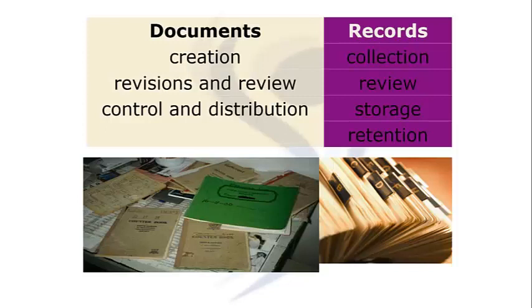Documents and records. Many of the 12 quality system essentials overlap each other. A good example is the close relationship between documents and records and information management. Documents are needed in the laboratory to inform how to do things and how to do them well, and laboratories always have many documents. Records must be meticulously maintained so as to be accurate and accessible.